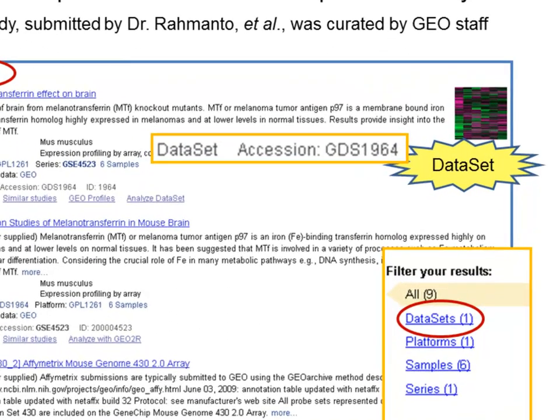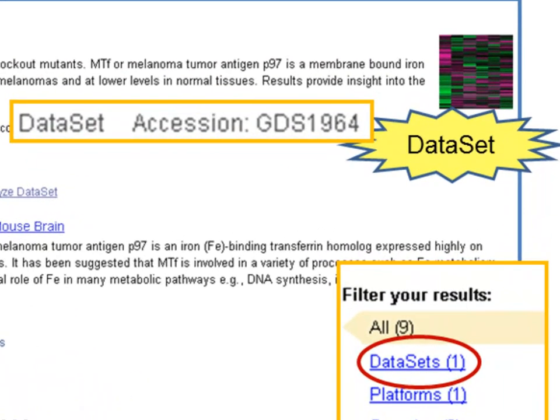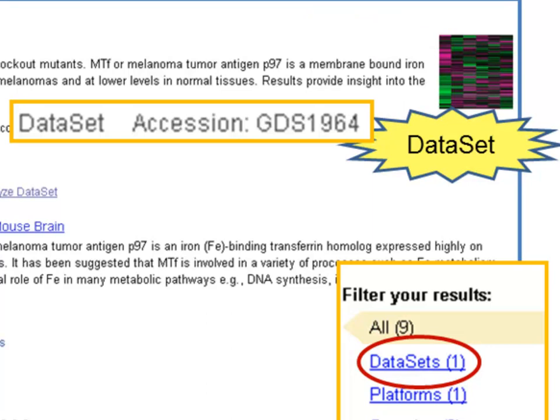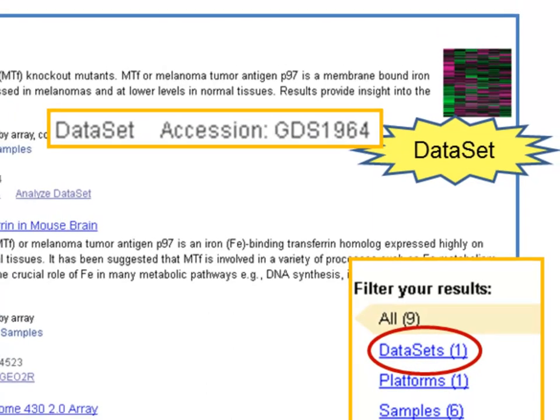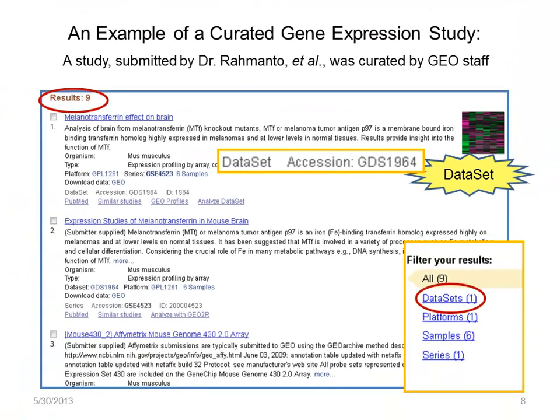A GDS entry is easy to recognize because only curated records have these heat map images. It looks a bit like an array, but it is not. If you count the columns, there are six here, which equals the number of samples.